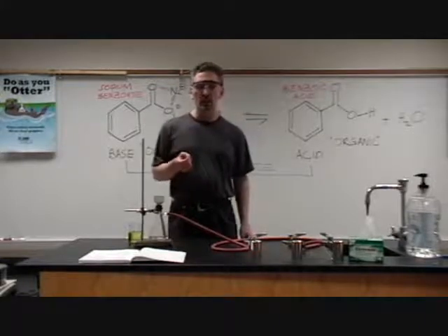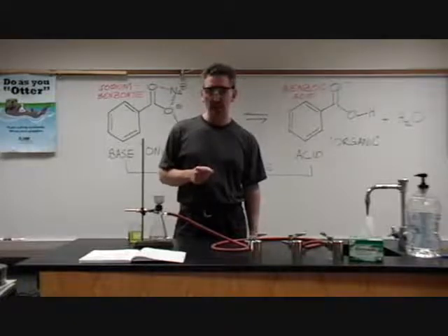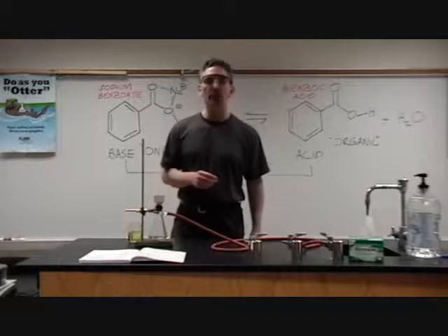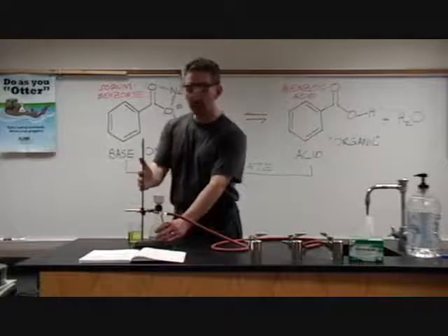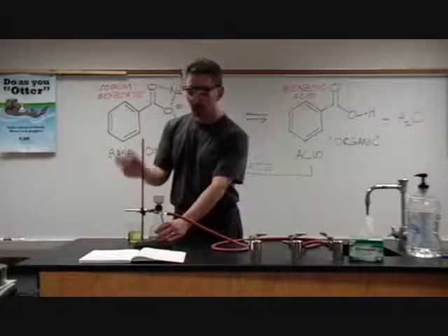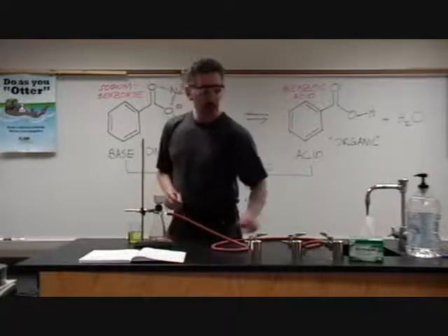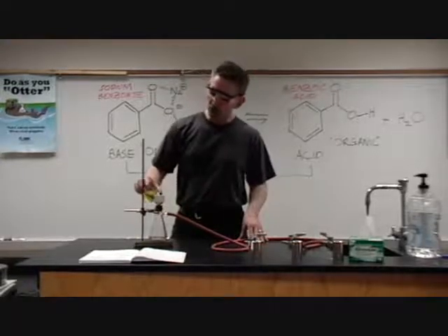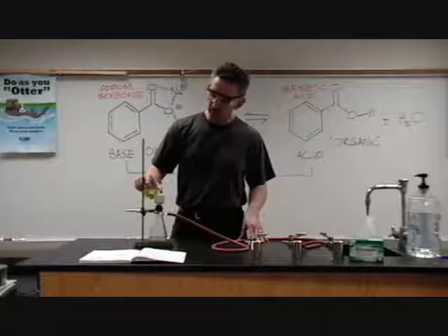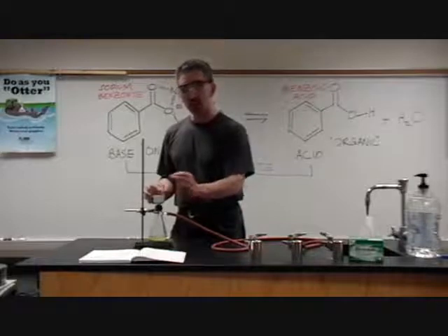Now remember, once your chemical reaction is finished, if you do produce a precipitate, you'll need to filter off your liquid, the water, by using a Buchner funnel and flask. So connect up your Buchner flask to a clamp stand so it doesn't fall over. Put a piece of filter paper inside to neatly fit in the bottom of the funnel. Connect up to the vac line, turn on, and then filter your solution through. Any solid precipitate you formed will be retained in the filter funnel.